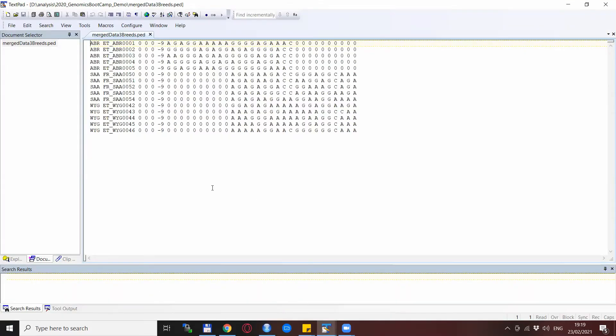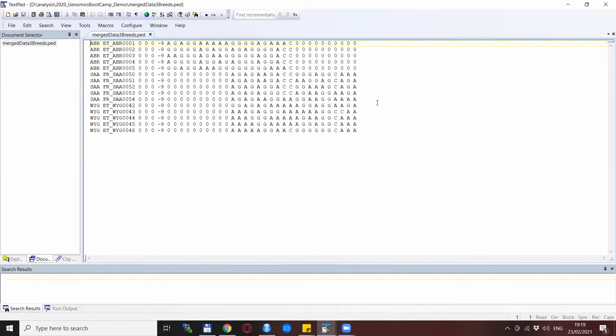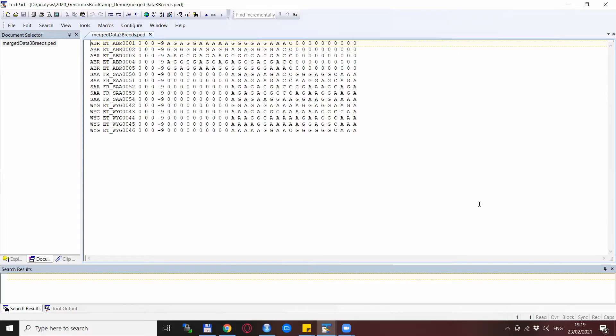So this is how the merged dataset from the three breeds looks like. You see that breed two and three are merged in a proper way so there are no missingness in this block, but then the blocks that are not appearing in breed two and three are set to missing for them. And again as previously, the block that is not appearing in breed one is also set as missing for this breed.